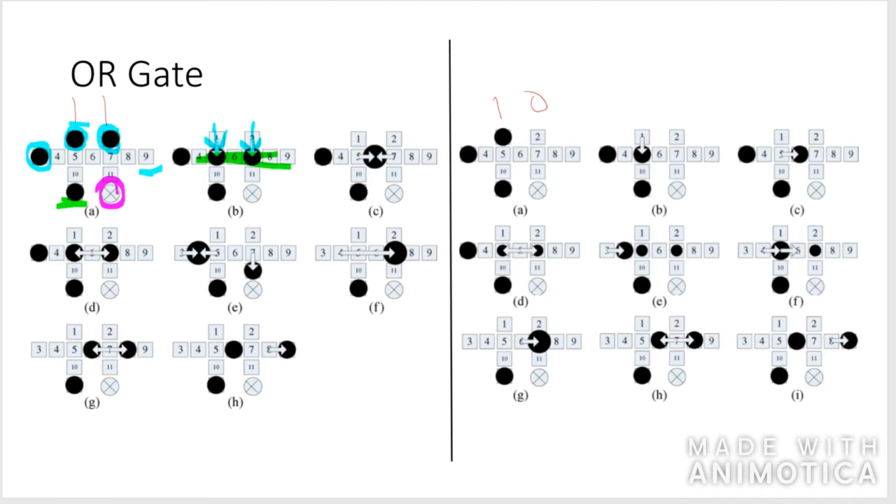The droplets are diverted into the processing channel, and the way that they are moved is through electrowetting on dielectric. What that means is that there are little droplets that go through the channels of this microfluidic chip. That's a droplet, say that's the surface of the chip. Electric pulses are generated and directed to a certain spot of the channel surface, and that repels or attracts a droplet. So that causes the droplet movement. And these electric pulses are controlled using a clock.